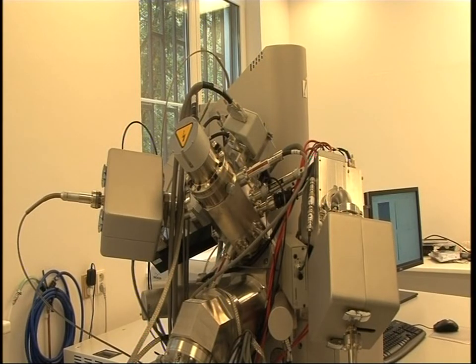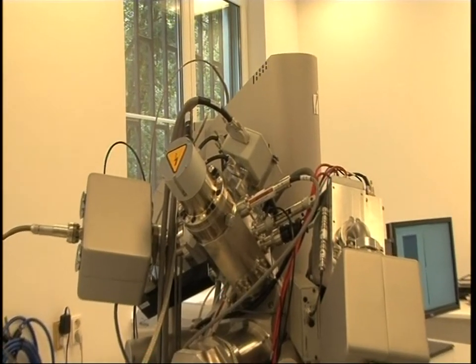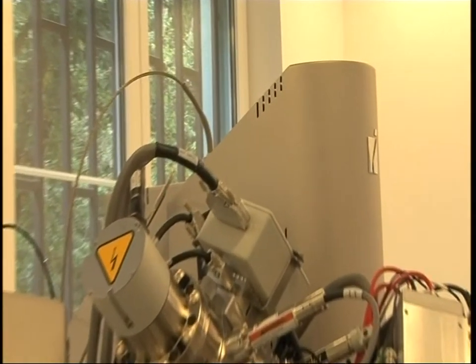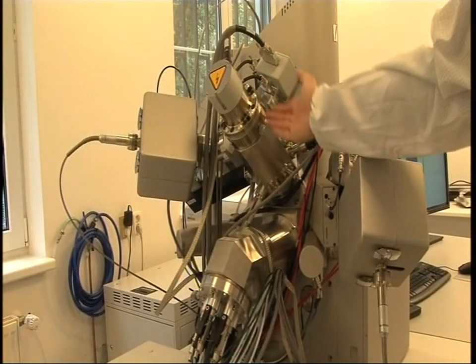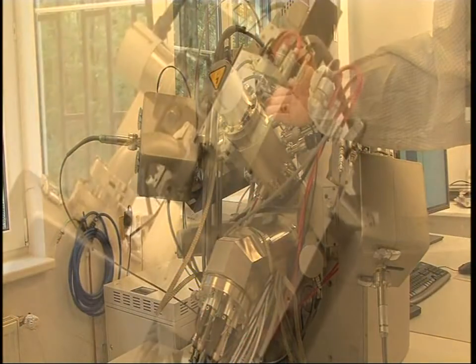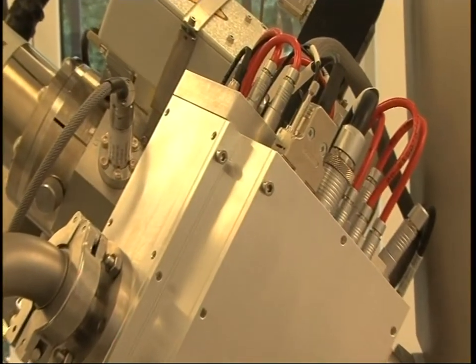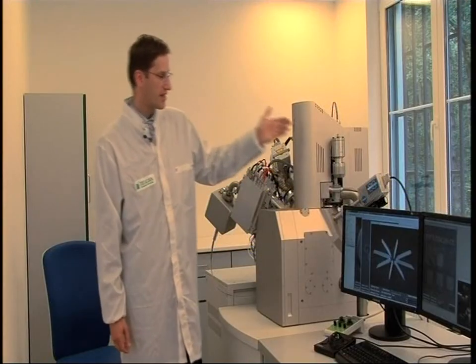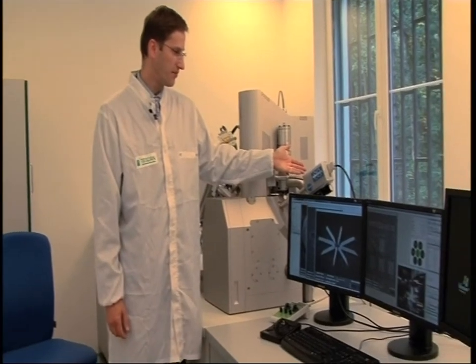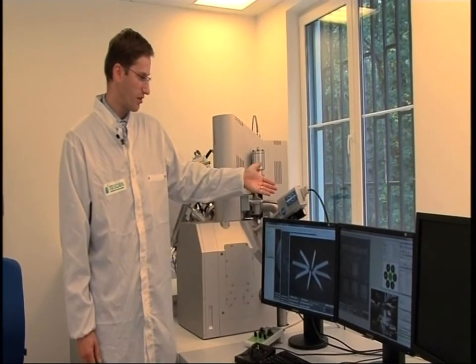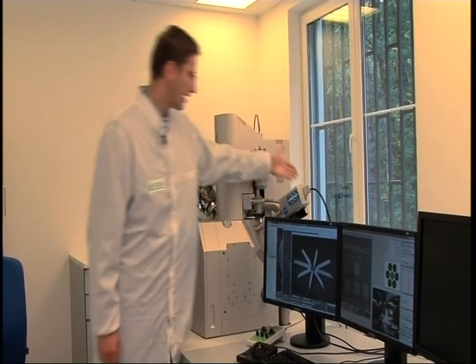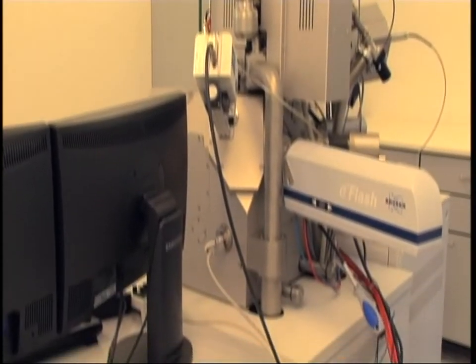Fiblis has a scanning electron microscope, an atomic force microscope, a focused ion beam, a time-of-flight mass spectrometer, an energy dispersive X-ray spectrometer, and also electron back-scatter diffraction.